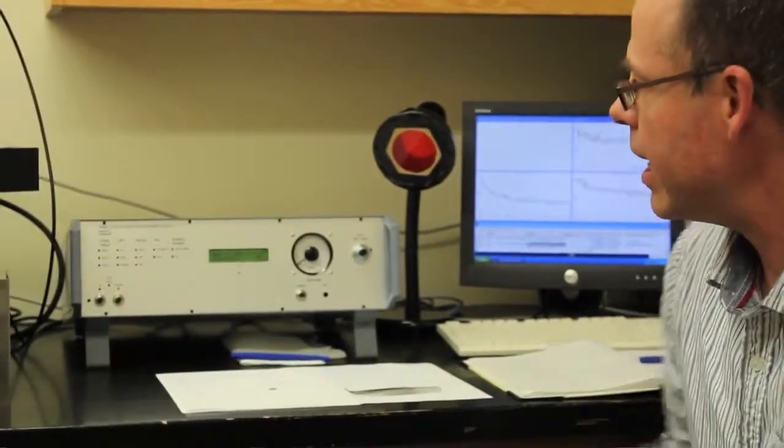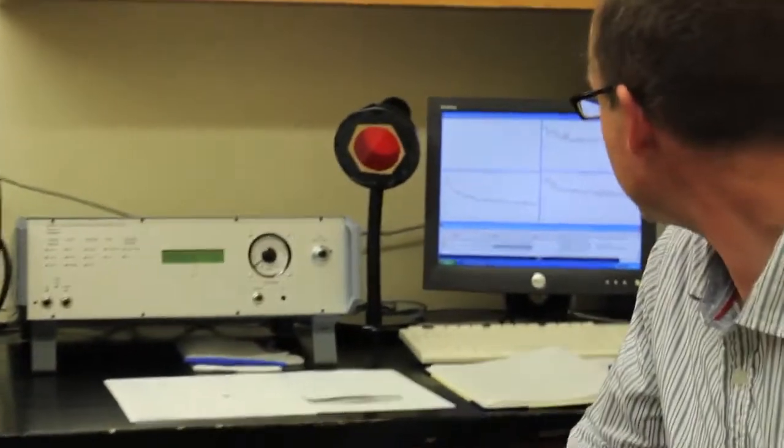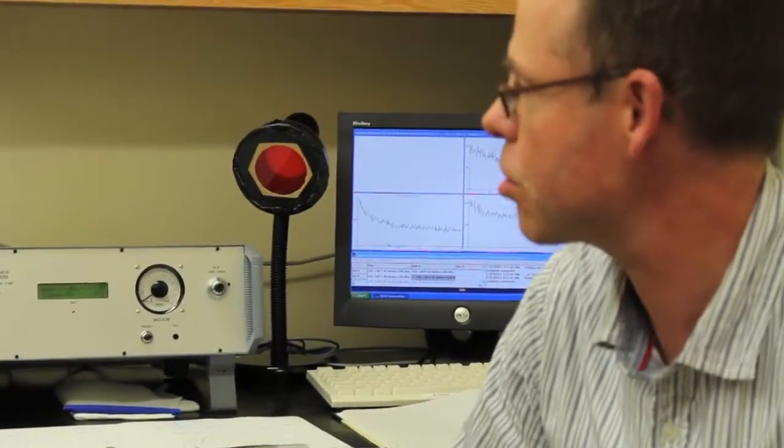Some of these processes involve paleoclimate, some of them involve fault movement and tectonics, and some of them involve events such as ancient heating. So if you can hear the machine beside me whirring away, then it's currently making measurements. In a few minutes we'll see some data beginning to appear on the screen.